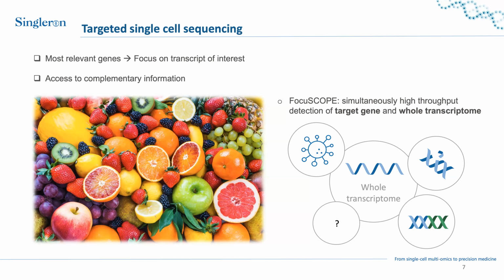Our next question is about the capture rate for mutated sequences. Again, about the FocuSCOPE.